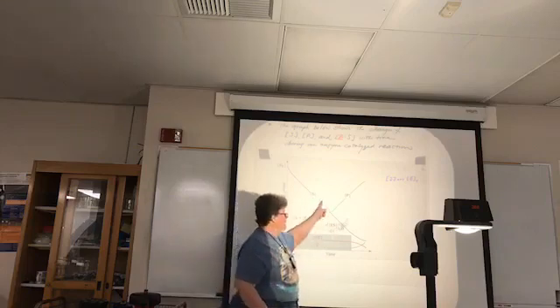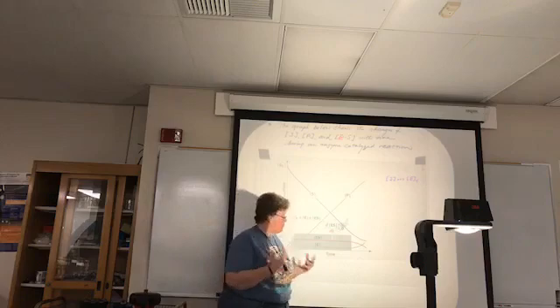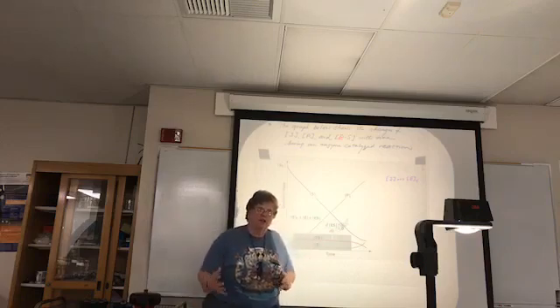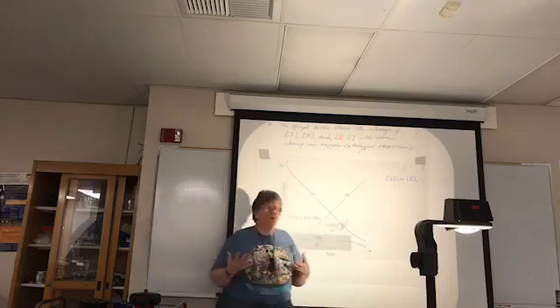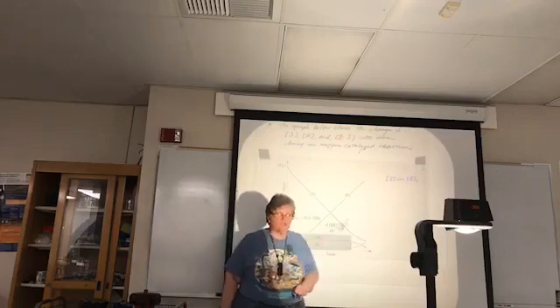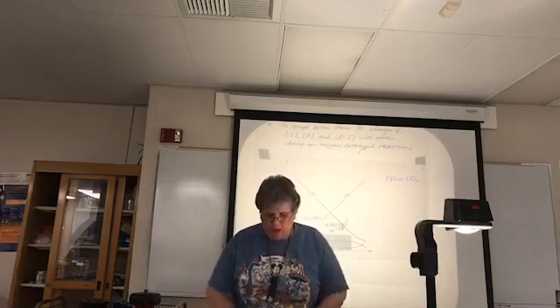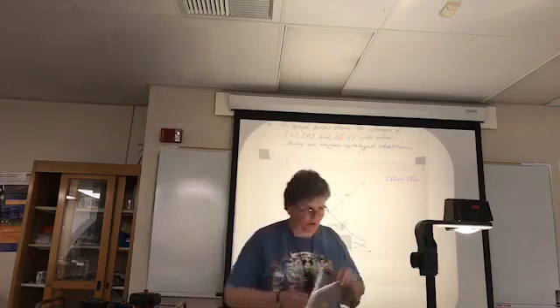until you start to run out of a significant amount of your substrate. So generally, your best numbers for the reaction are going to be before the reaction starts to slow, before you have used up approximately 10% of your substrate. You're going to get your most accurate numbers then. When your reaction rate starts to slow, you are no longer in Michaelis-Menten kinetics, and so you should not be using any numbers that are not in a linear range.